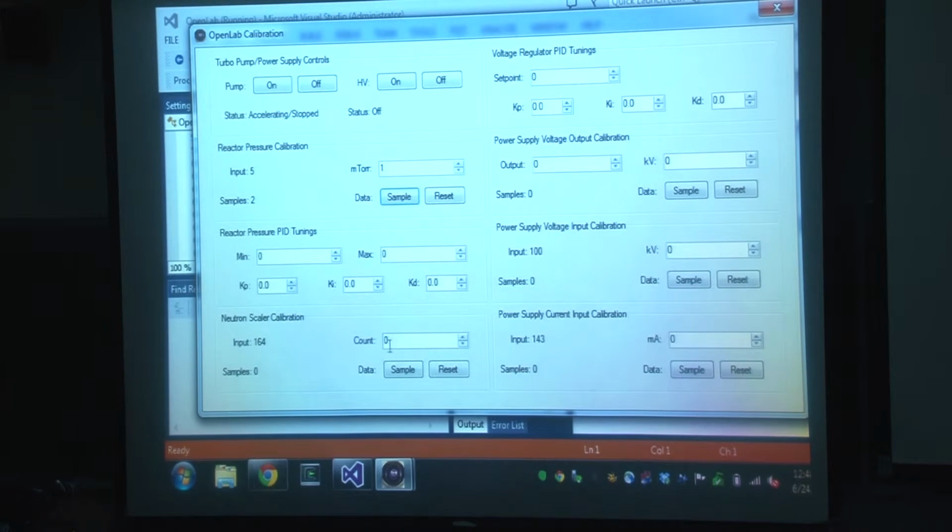Ideally, I'd like to have list views for these so you can choose the samples you want, in case you click sample and don't actually want that sample. For some of these fields, I needed forward and reverse mappings. Let's say you want to set pressure for your thermocouple gauge. You need to be able to give an electrical input from the gauge and convert it into a pressure, but then also be able to set a pressure and convert it back into an electrical signal. So I just swapped the X and Y points for calculating the splines, and actually keep two sets of splines, one for the forward calculation, one for the reverse. But it's all the same set of points.